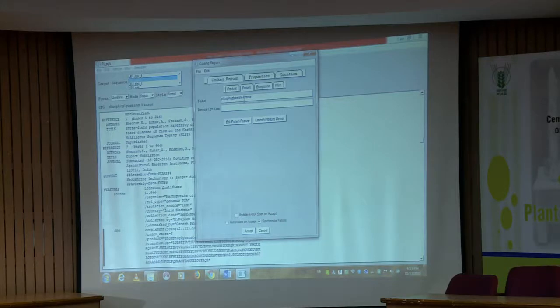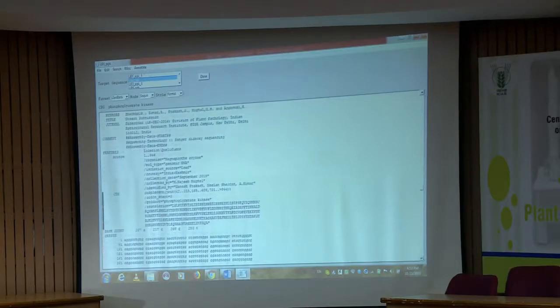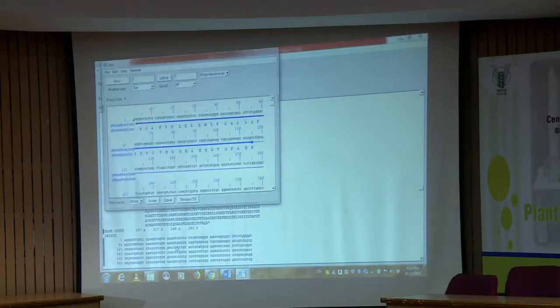The more you enter, the more transparent information will be available for the second researcher, right. So, all these options you can highlight and keep on adding the things. Here it will show you all the options, whatever things are there, that will be highlighted over here.